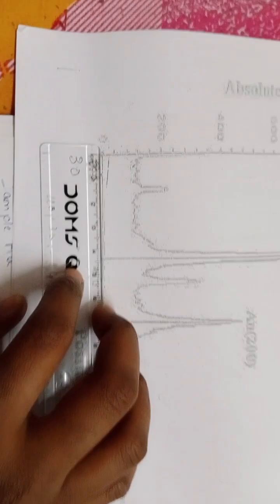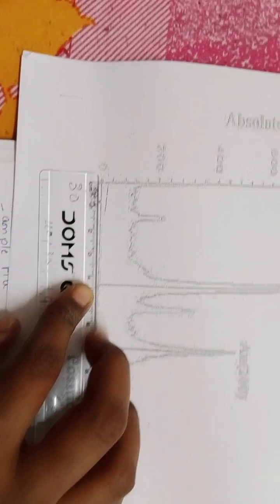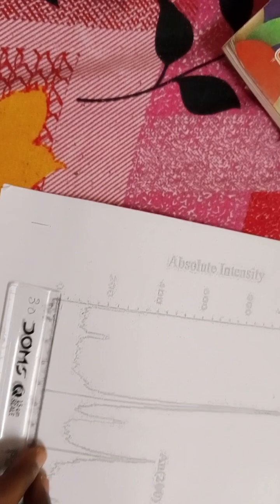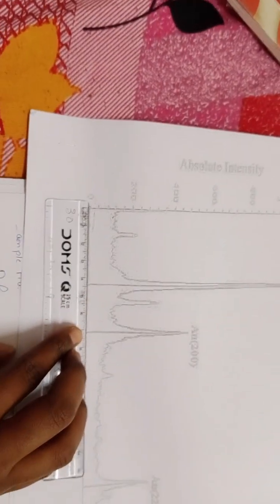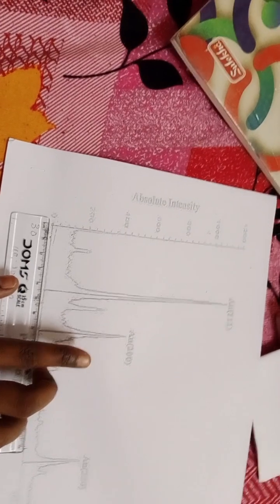If you observe cleanly from 0 to this, the measurement is 4.4. From here to this point, wherever we got a peak value, that much only we have to calculate, not this small peak. Wherever they have written this AU equals to the Miller indices HKL value, that only you have to take.